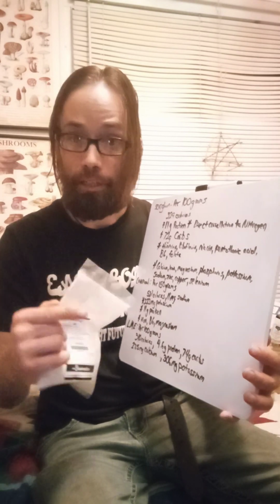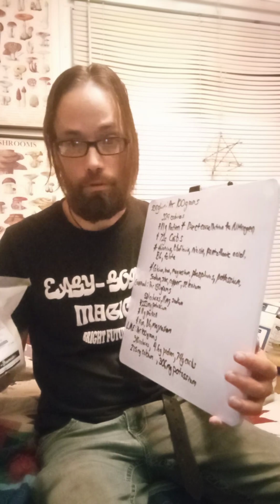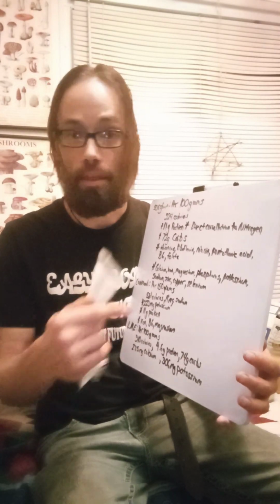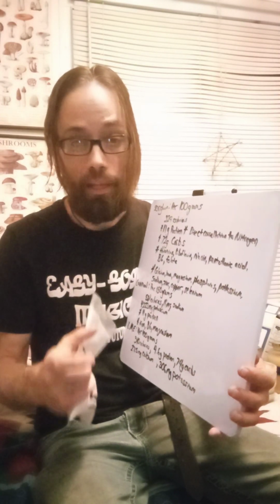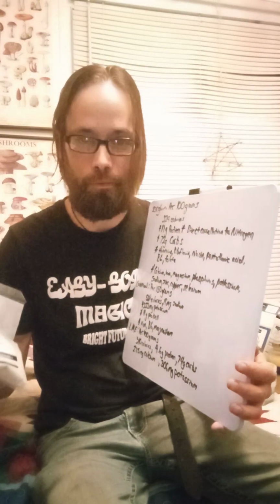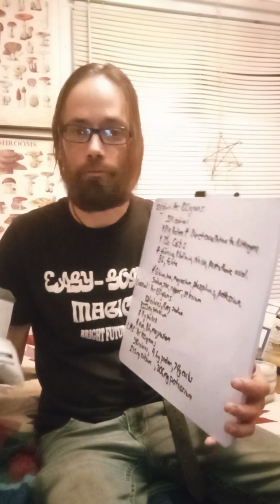I buy plates, I cut up a whole plate, put it into several still water vials, several slants, and a couple of plates that I'm going to start with. And then all you need is a little tiny piece. That one plate can make like 100 of the next passage number or transfer number for making spawn.